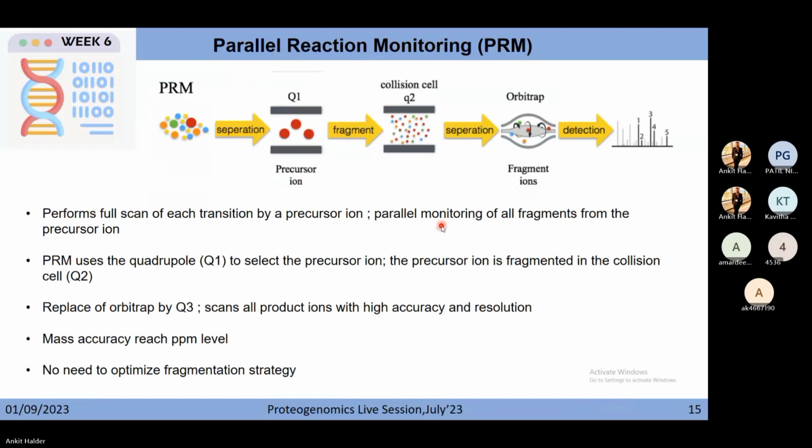Second, you will have all those miscleavages from the sample preparation. Here you are giving the separation and letting all the ions get detected. You can see the fragments, these are the intense fragments. So many fragments are generated, because with one precursor it is trying to identify all those fragments in the Orbitrap. So this is the simple mechanism of PRM.